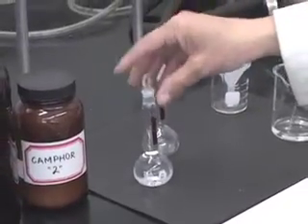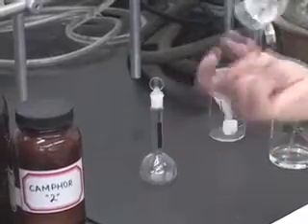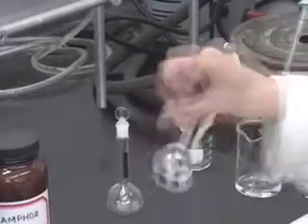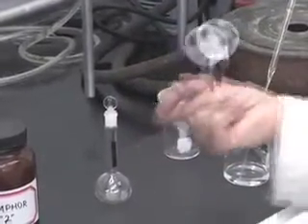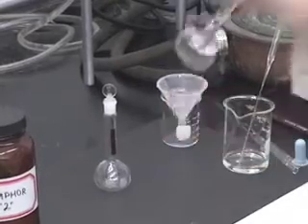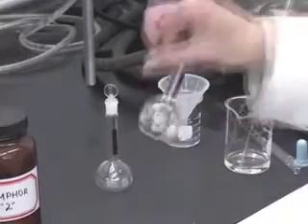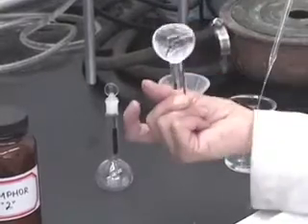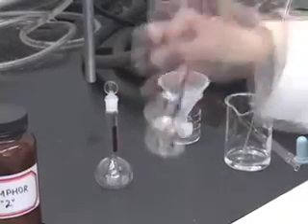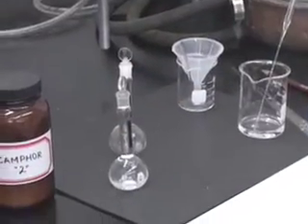Now, all I need to do is put the stopper back on and mix the solution well. Notice that I am supporting the stopper with my palm so it doesn't pop out.